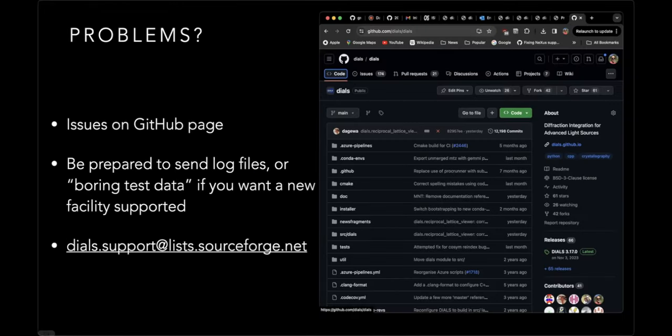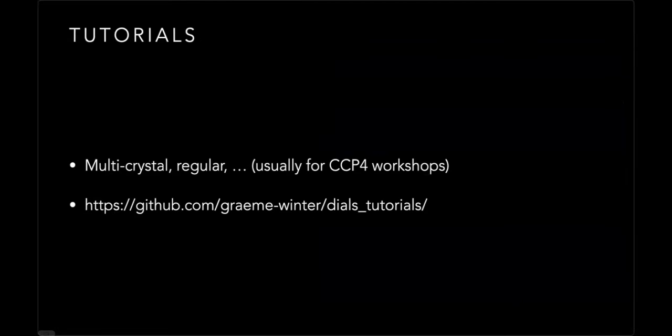So we've got tutorials linked from dials.github.io, which is our main webpage. I've also got a load of tutorials that I've written for various CCP4 workshops. These are not necessarily as well written, but explore some of the more interesting corners of what you can go and do with Dials. These are on my GitHub page here. I'm sure we can get the links circulated at the end.